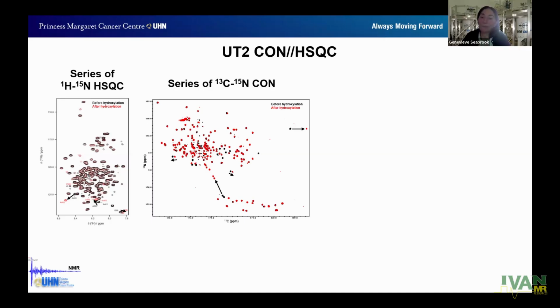The cis-trans isomerism is actually better monitored by the difference in the C-beta, C-gamma chemical shifts of proline. If you take the delta-delta, C-gamma minus C-beta, if it is 4 to 5 parts per million, then it is trans, but if it is more than 8 parts per million, it's actually cis conformer. So it's very easy to track from the carbon spectra, but you'll need a proton-carbon HSQC or an HSQC TOCSY-like experiment for that.